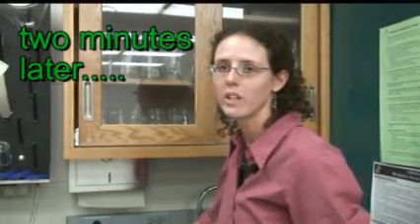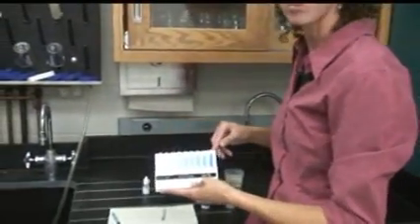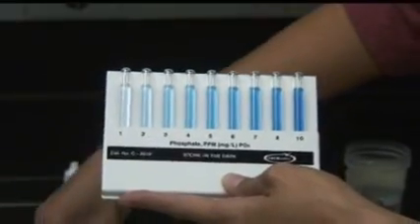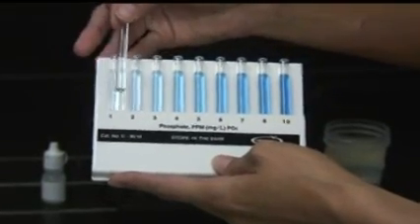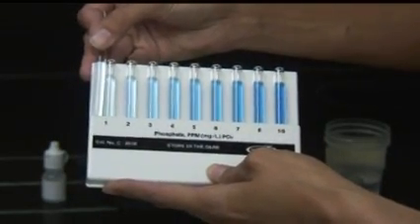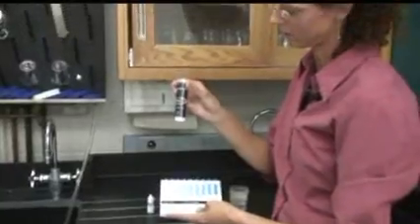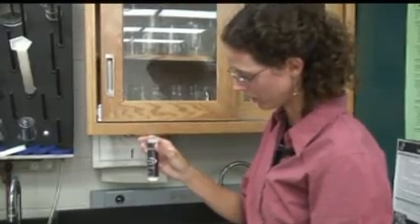In order to read the test, once you've waited two minutes and the color has developed, first start with the flat plate. This one reads from one to ten parts per million of phosphate. You'll take your tube and compare the color of the tube to the various shades of blue on this plate. If it's below one, you then go to this comparator, which is basically like a kaleidoscope, and it measures from zero to one parts per million phosphate.